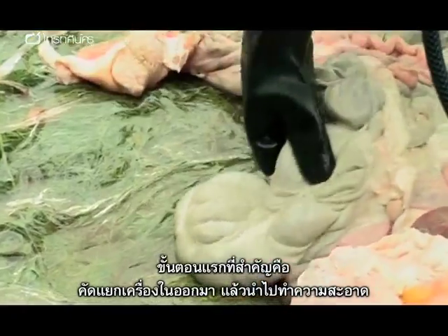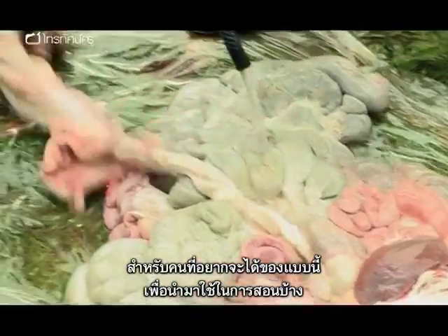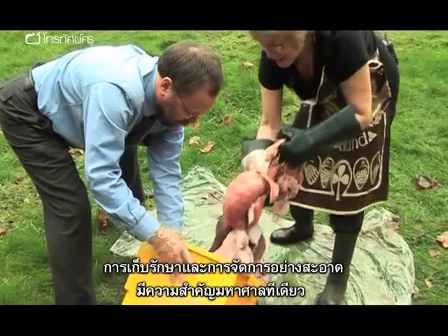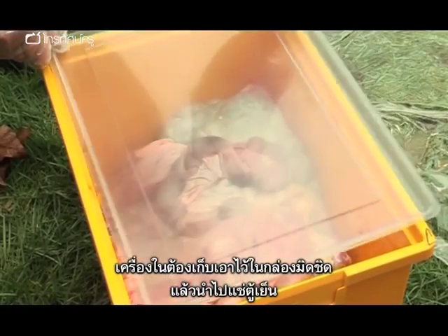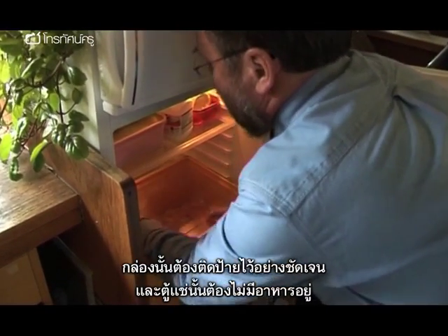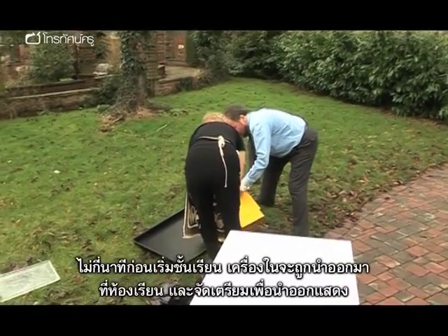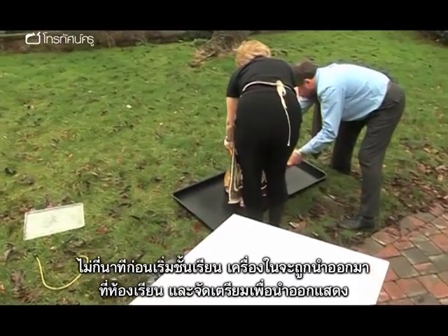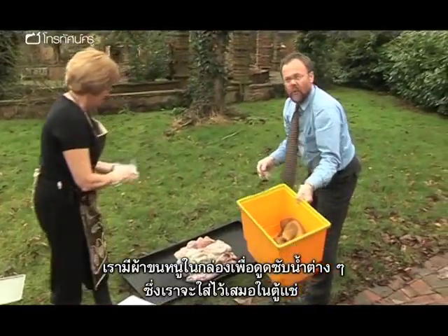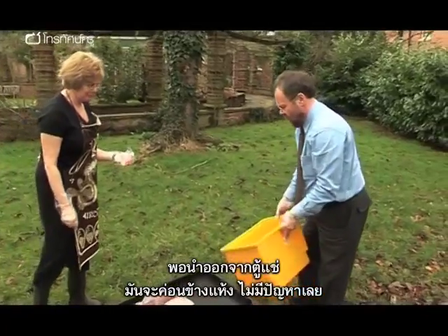The first priority is to thaw the guts out and give them a good clean. For anyone thinking of acquiring this sort of material for teaching purposes, hygienic storage and handling are of paramount importance. The entrails must be stored in a sealed box in a fridge, appropriately labelled and not containing food. We've got a towel in the bottom which has soaked up any juices, so when it comes out it's pretty dry — no problem at all.